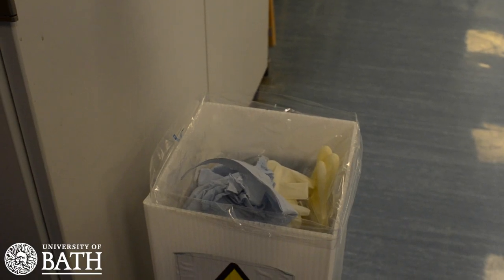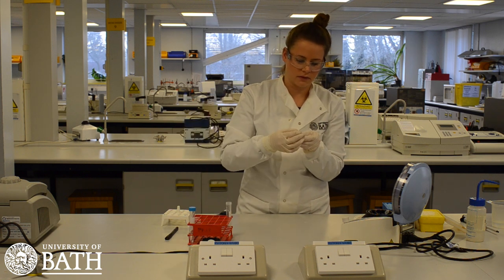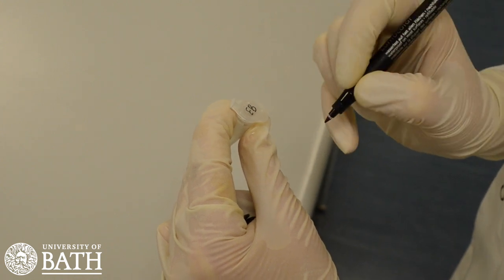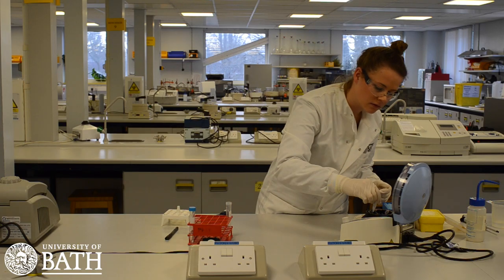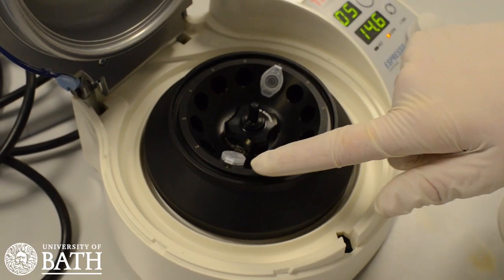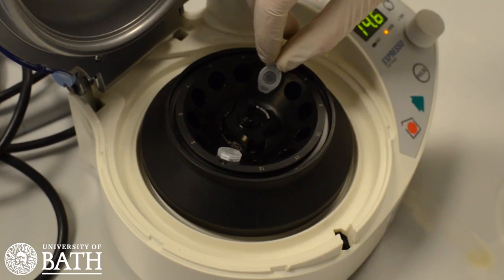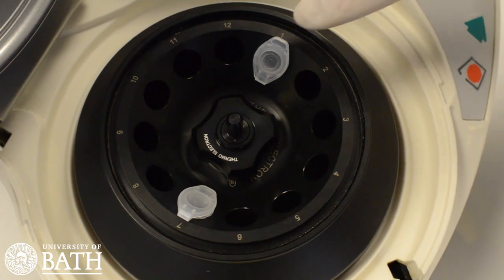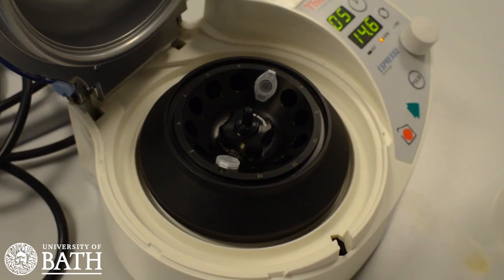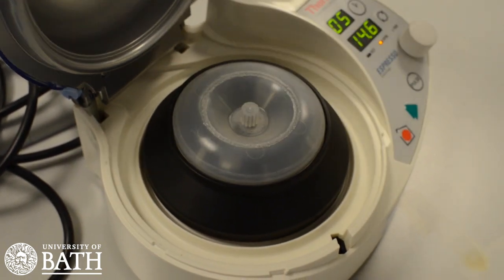Discard the pipette tip to avoid cross-contamination. It is a good idea to label the microcentrifuge tubes to stop samples from different students becoming mixed up. When putting the tubes into the centrifuge, it is important that the centrifuge is balanced. In this case, another tube containing 1 millilitre of water has been placed directly opposite our sample. It is also important to ensure that the hinge of the microcentrifuge tube points to the outside. This all ensures that the centrifuge spins evenly.